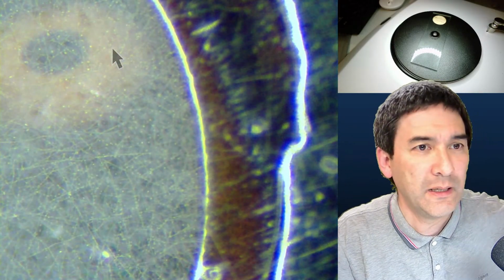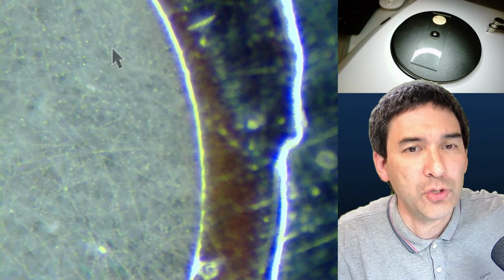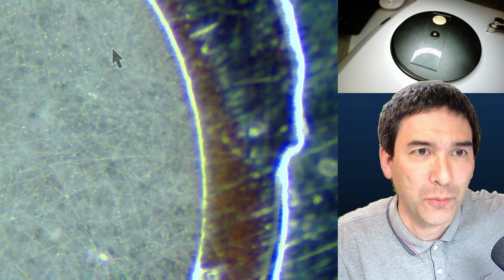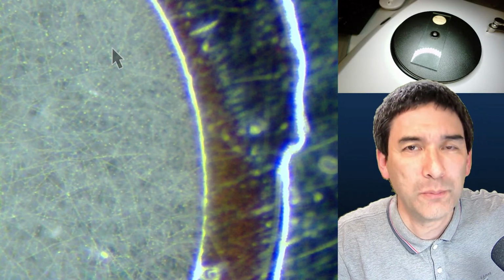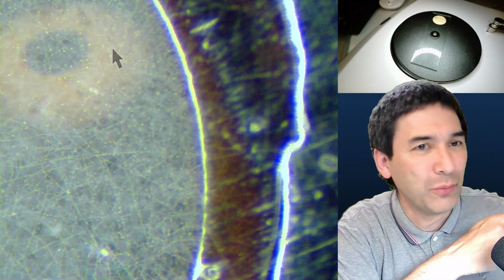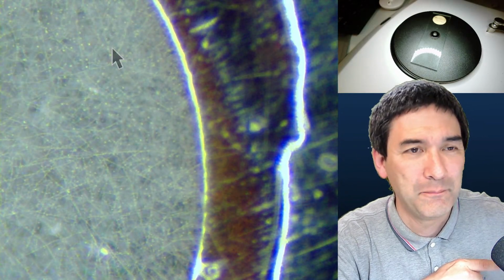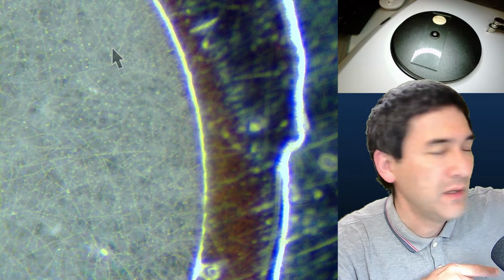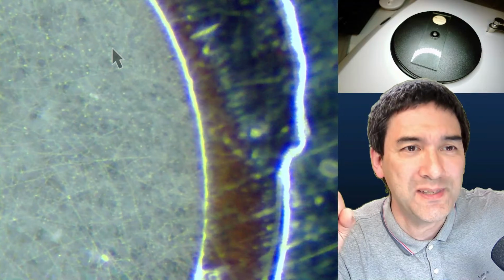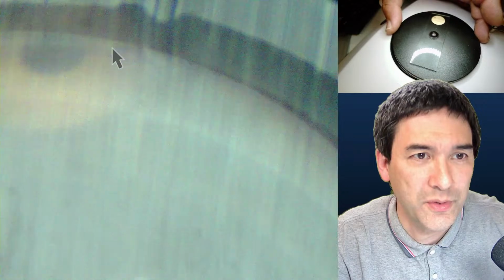This is actually a reason why, if you want to get a better image, if the image contrast is not high enough, it is because there's light entering the eyepieces of the microscope. Normally this doesn't disturb because you're looking through the eyepieces yourself and you're casting a shadow yourself. But right now I'm not looking through the eyepieces and this is pointed to the lamp, and therefore I'm now covering it and letting go. That's something where I have to make some plastic, maybe 3D printed plastic covers for the eyepieces so that I get a yet better image. Yeah, I just wanted to share this with you.